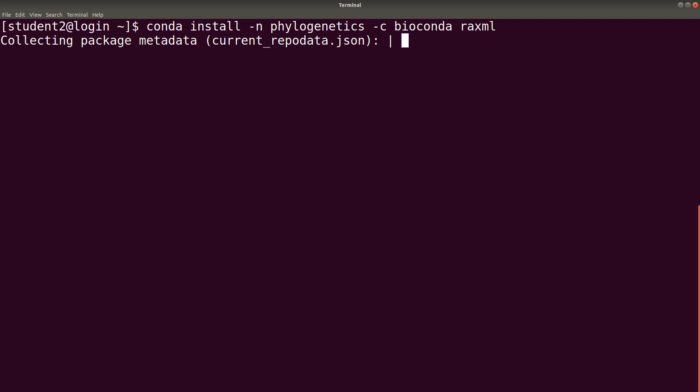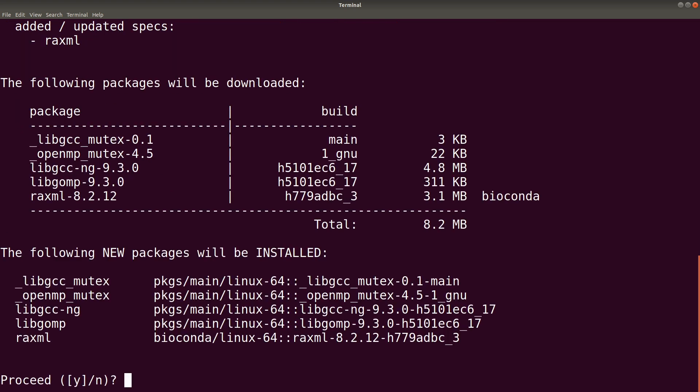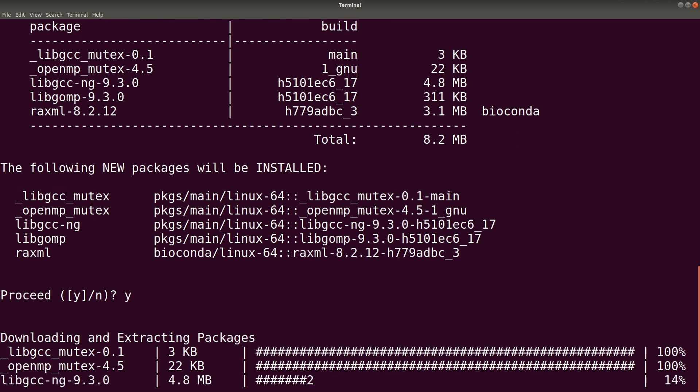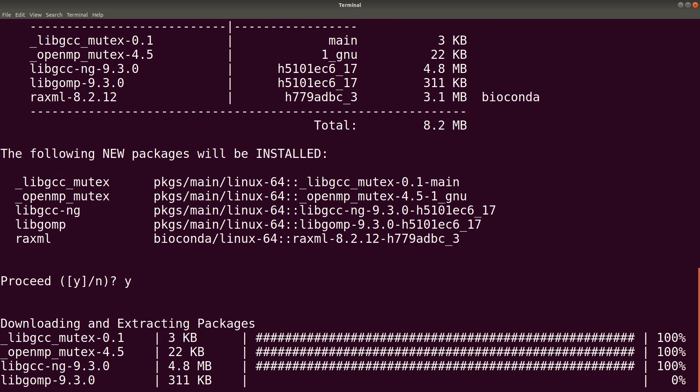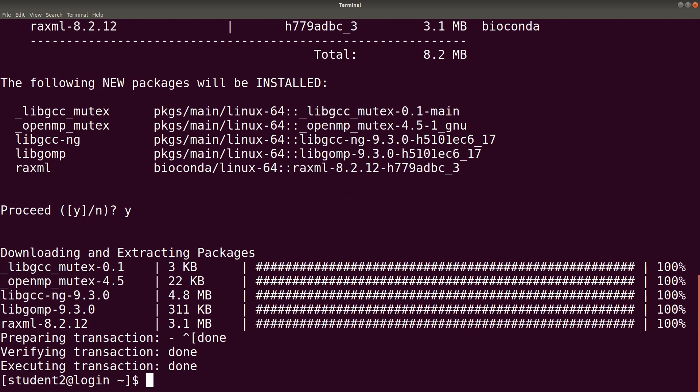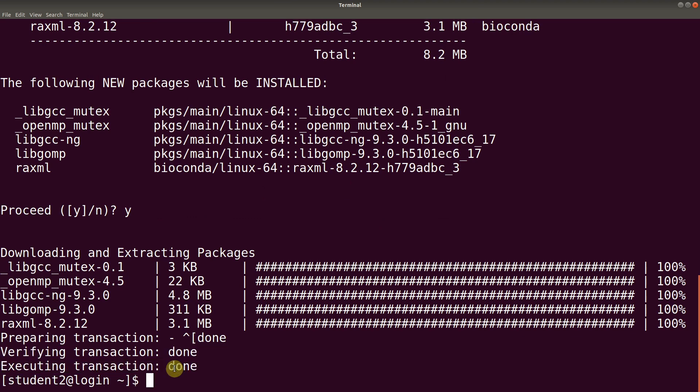We will also confirm this operation. We type Y. Then packages will be downloaded, including dependencies. So, we will wait for it to complete. Operation is now successful. And so, we will have these prompts coming up.